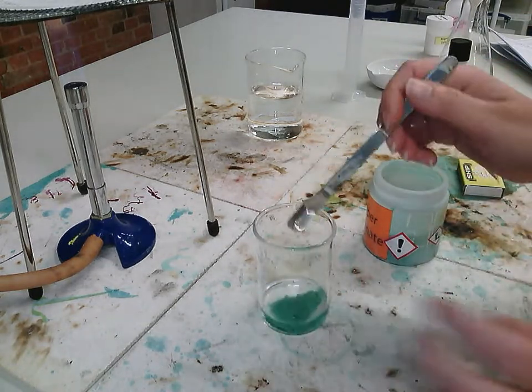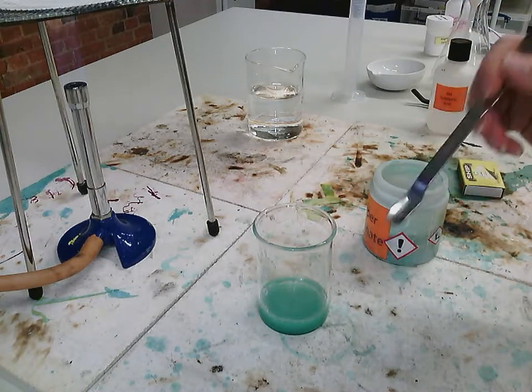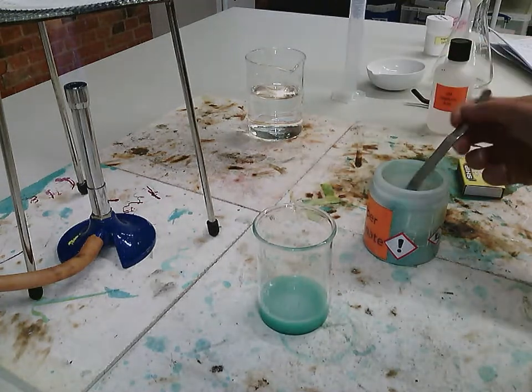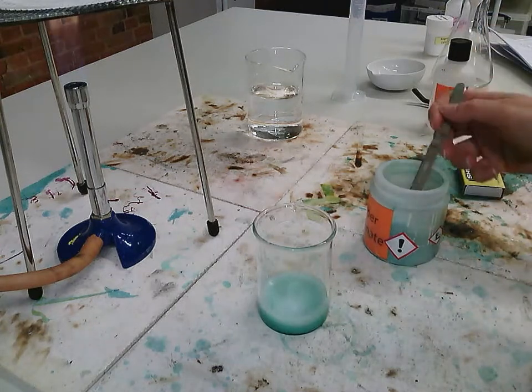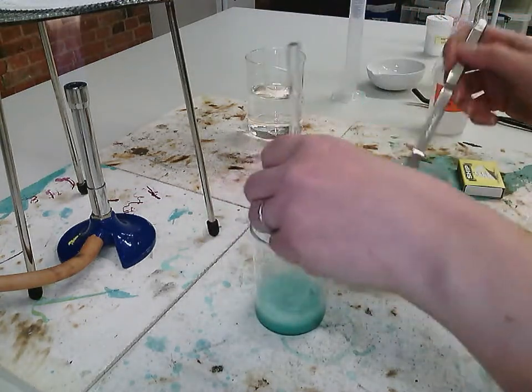So you should be able to see as it goes in, it fizzes. So what I do during this experiment is I keep adding it until it stops fizzing. Okay? So just keep adding it until there's no more fizzing. You can give it a little stir every so often.